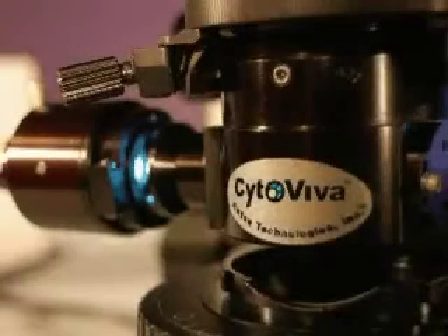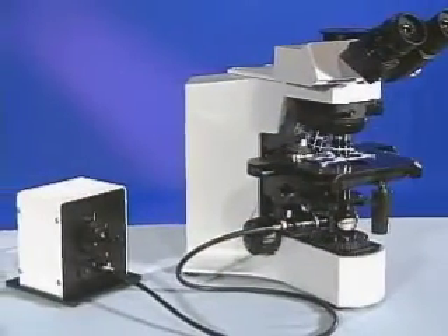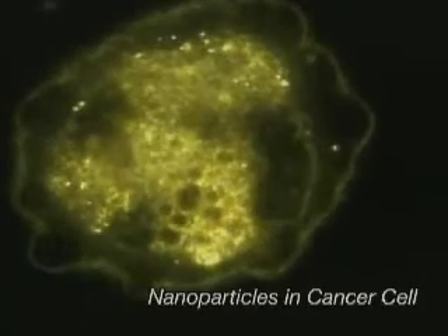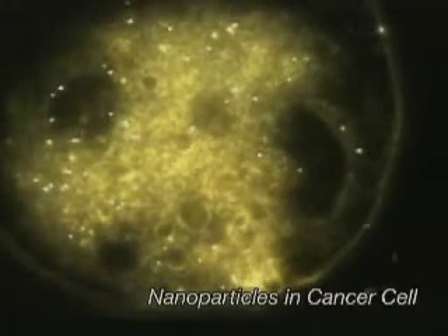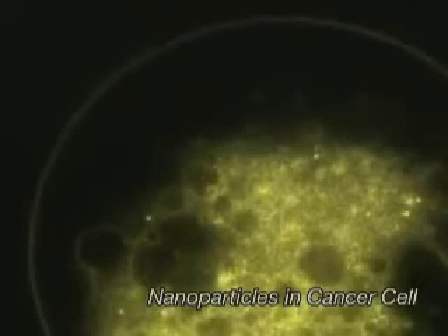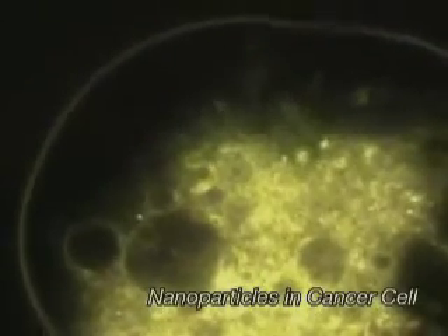The CytoViva Fluorescence Imaging System enables researchers to see live samples in real time at sub-100 nanometer resolution with or without fluorescent labels. With the CytoViva system, not only can you see your fluorescent labels, you can see them in the complete context of the sample, such as live cells, bacteria, and non-biological materials.